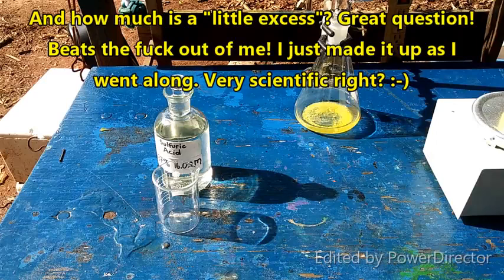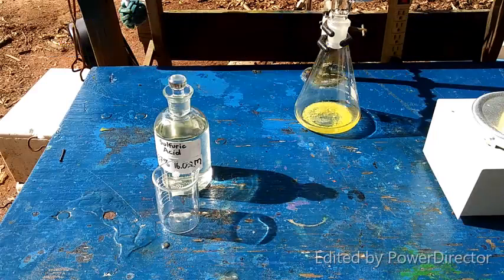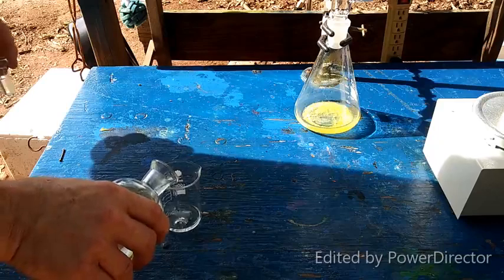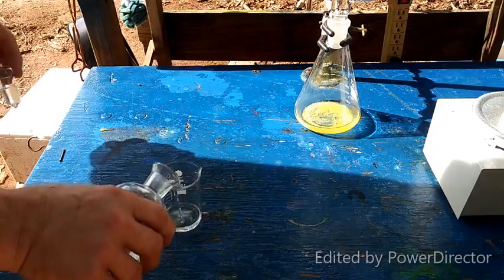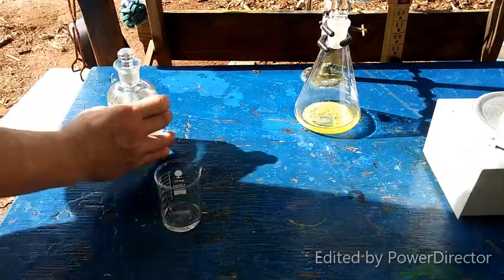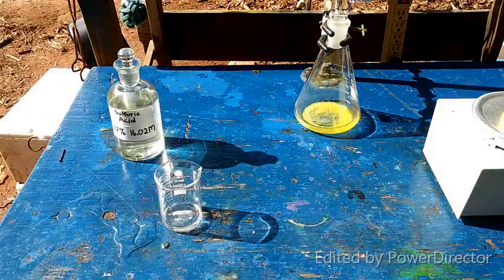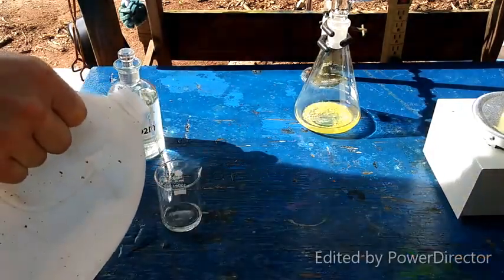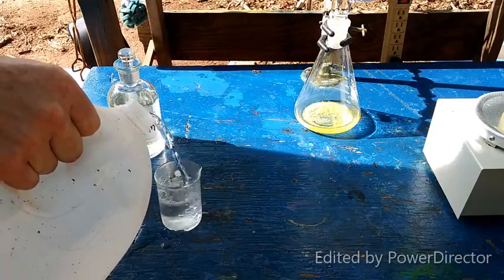Let's put this over here. Alright, now we need a little bit of dilute sulfuric acid for our gas generator. So just put a little bit of that in there. Maybe a little bit more. And where's the shitty tap water? Alright, shitty tap water. Oh, look, I'm adding water to acids.